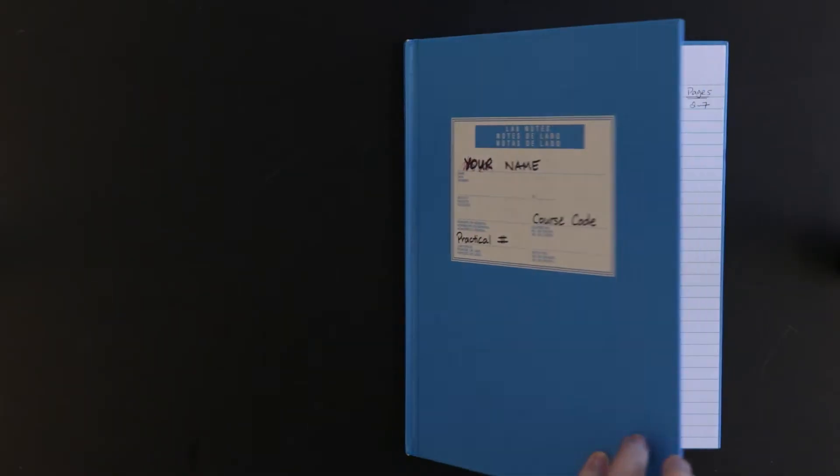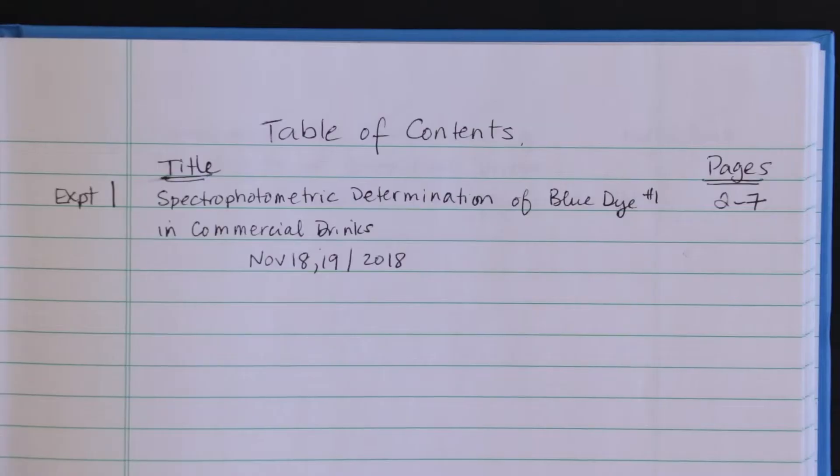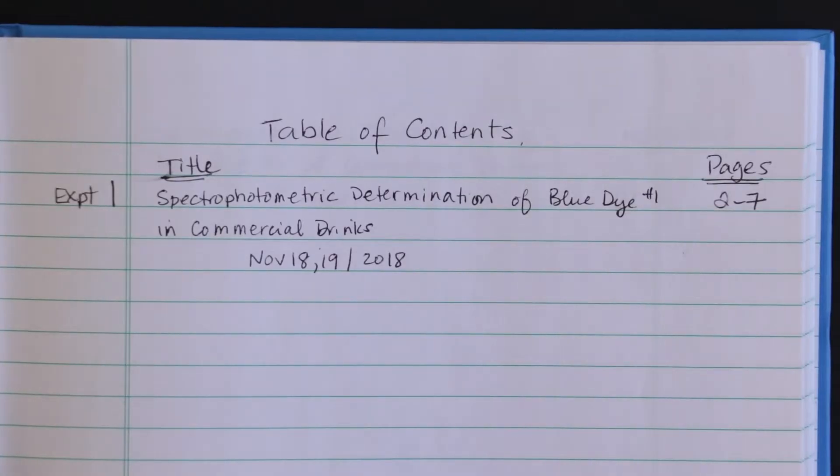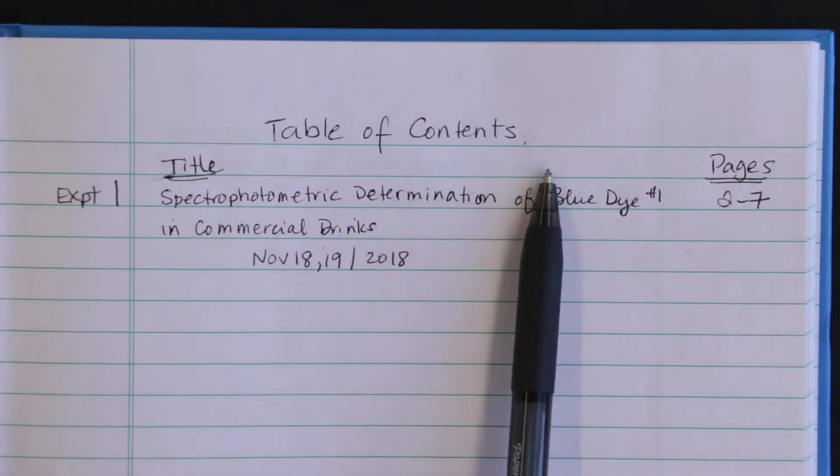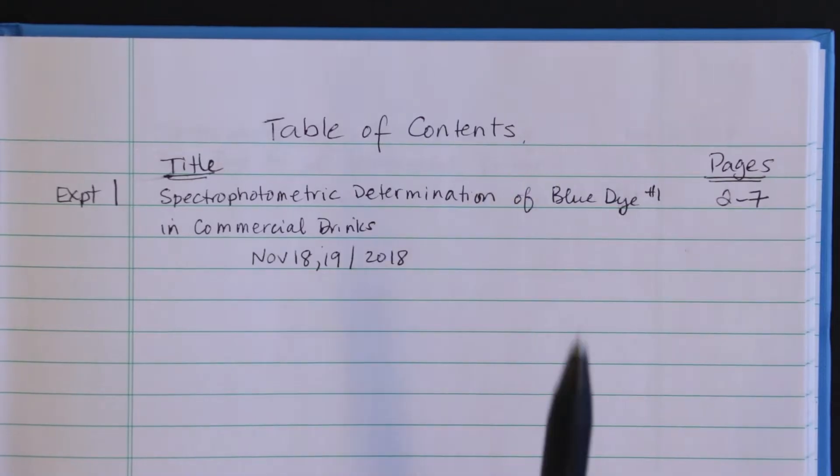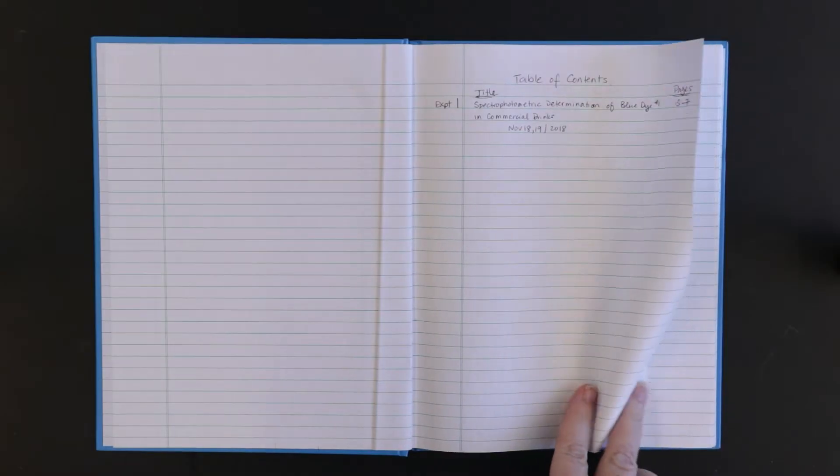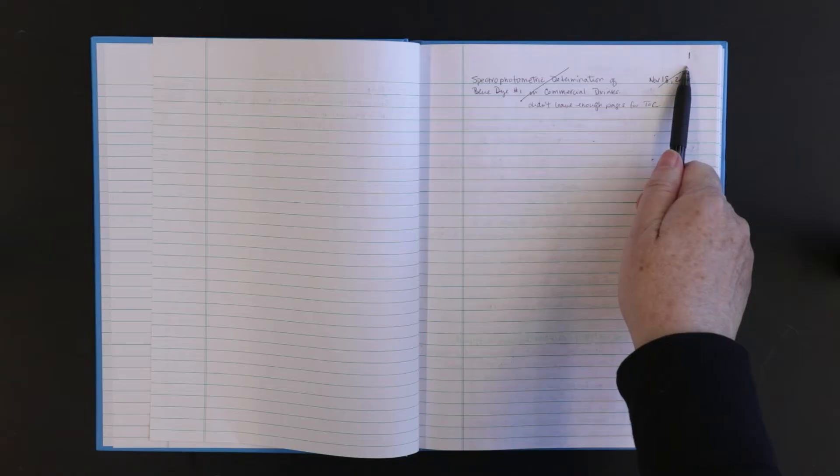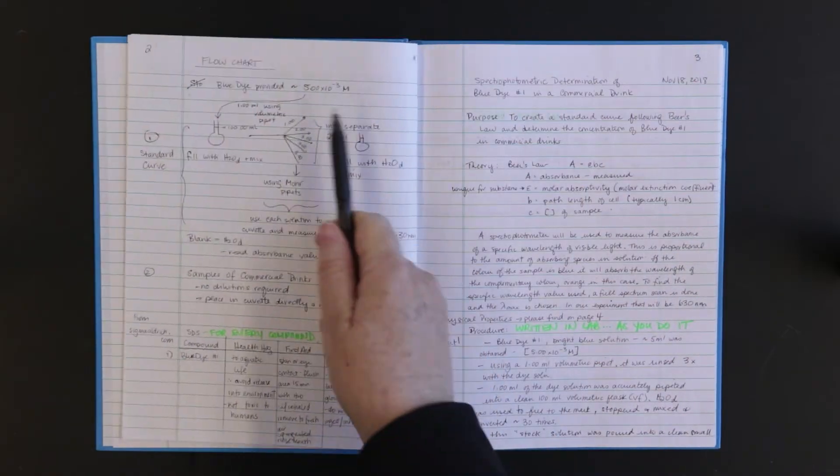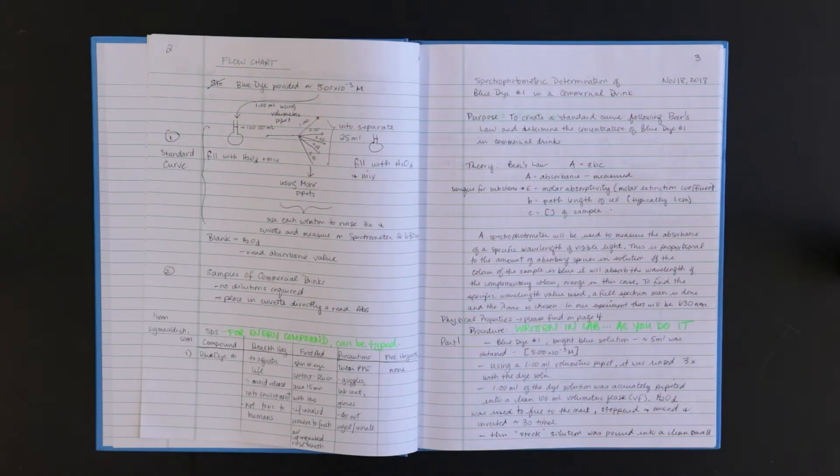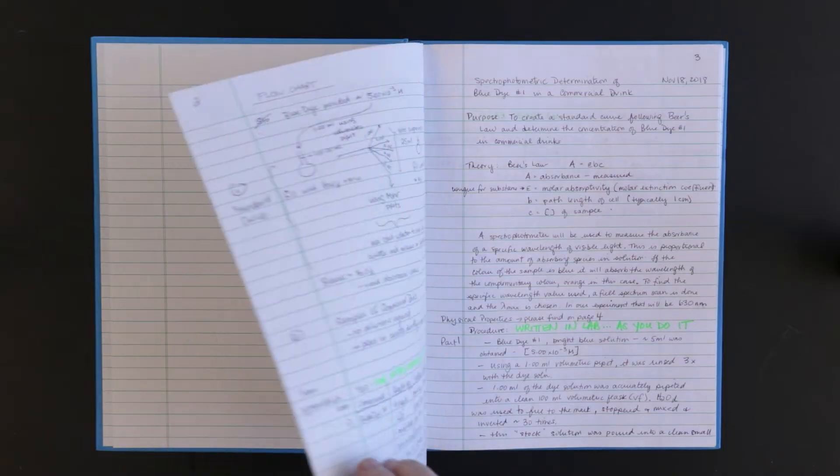Leave two blank pages at the beginning of your notebook so you can create a table of contents. This should include the title, page numbers, and the dates. Pages should be numbered from beginning to end of the book in increasing value. Do not use page number one when you start a new experiment. The reader will be able to find it based on the table of contents.